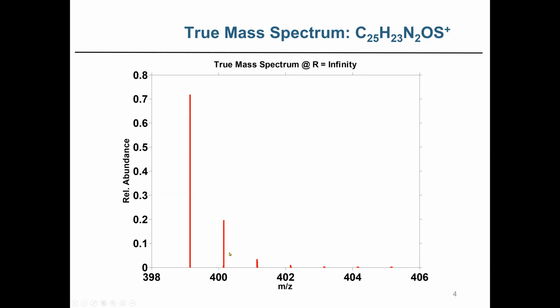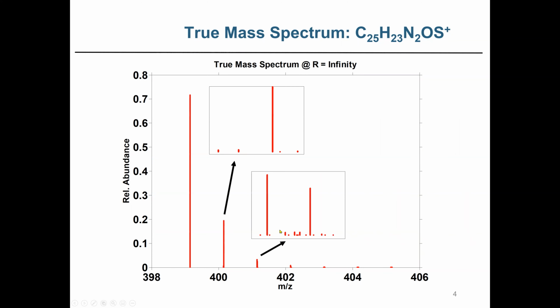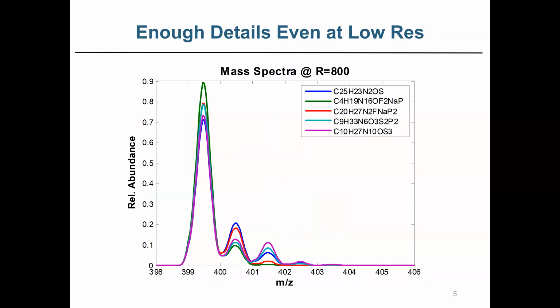If we look in more detail at the A+1, you'll see the isobars there, around which primarily is the C13 peak. And at A+2, you can see it's very rich in information. Obviously, if you centroid by just locating that peak, you're going to lose all that information. And that information contributes to our ability to help identify or quantitate that particular compound.